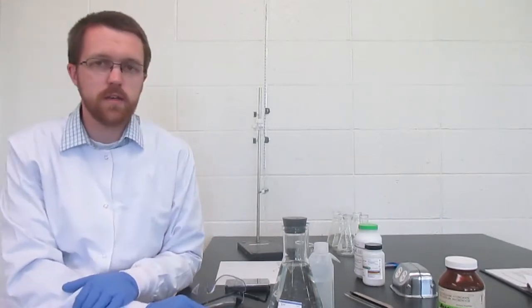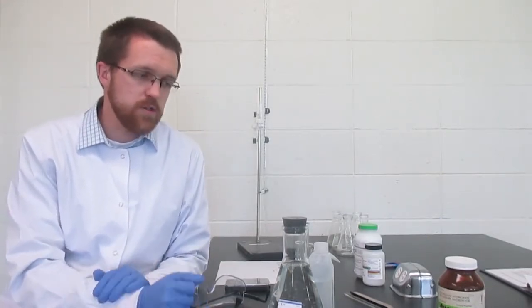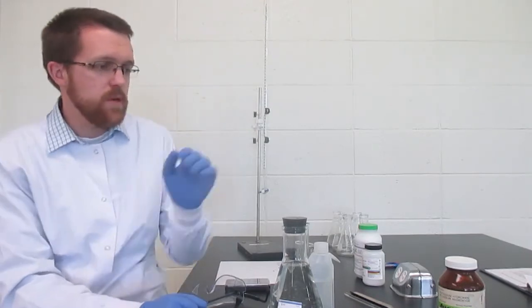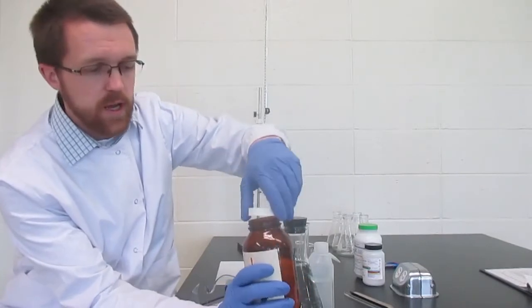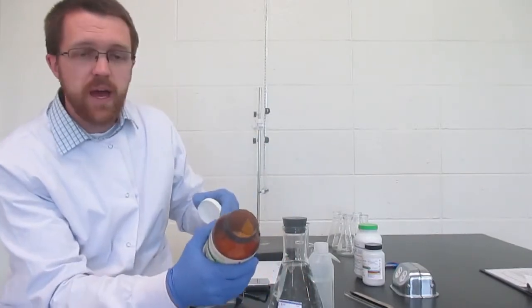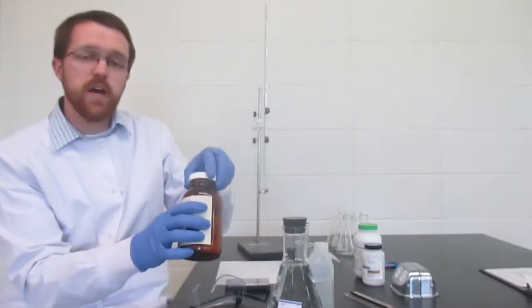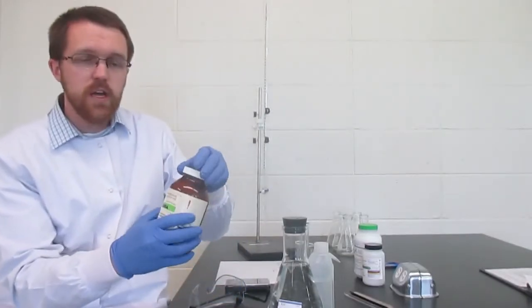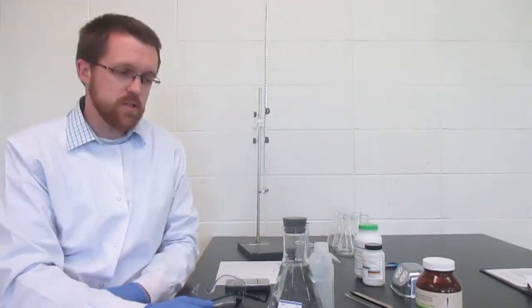potassium hydroxide and several other solutions work the same way has a special property and it's called hygroscopic. What that means is that these crystals will absorb water from the air. And so their mass, we can't be certain that it's all comprised of potassium hydroxide molecules. There's some water molecules in there depending on how long it's been exposed to air.